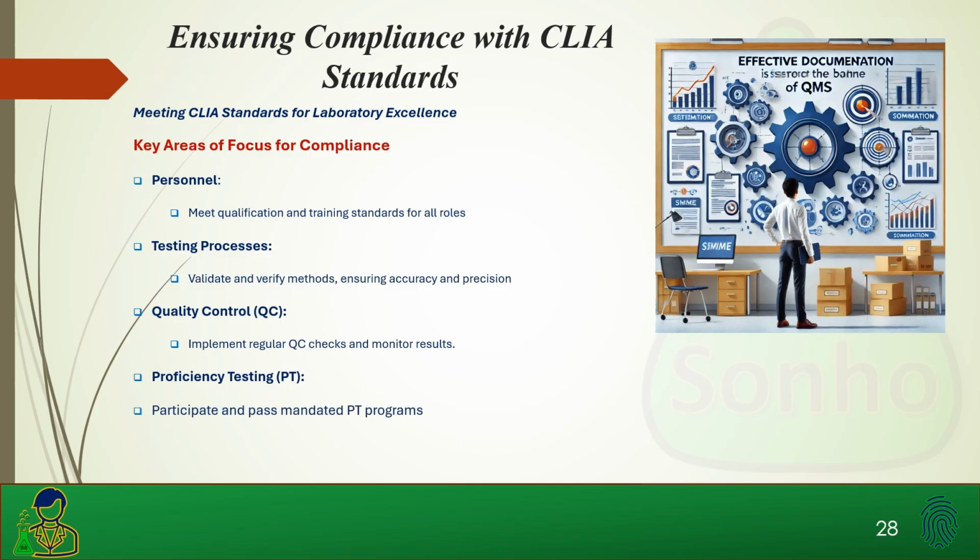And proficiency testing. Participate and pass mandated proficiency testing. You are required to be enrolled in a proficiency testing program for regulated analytes. Unregulated analytes, it is highly encouraged that you participate in PT programs.